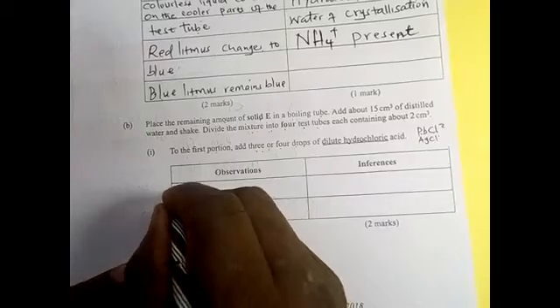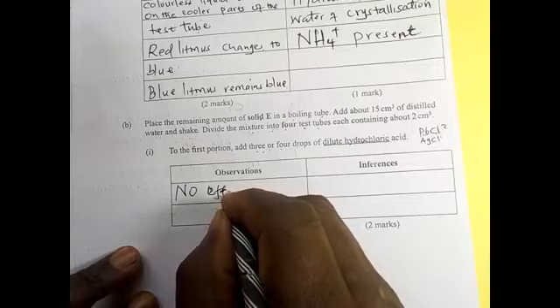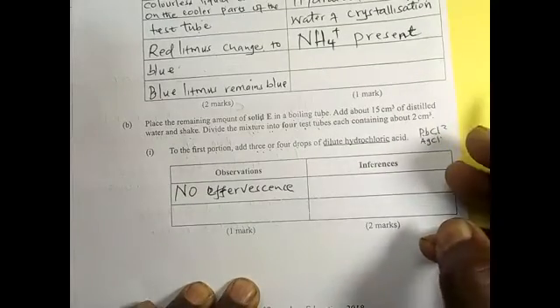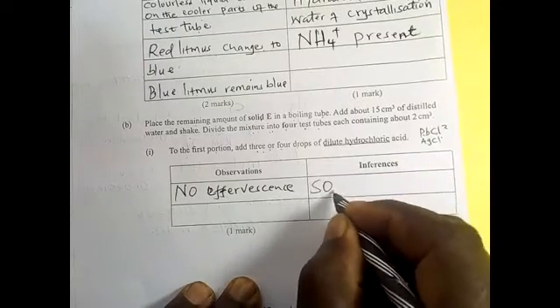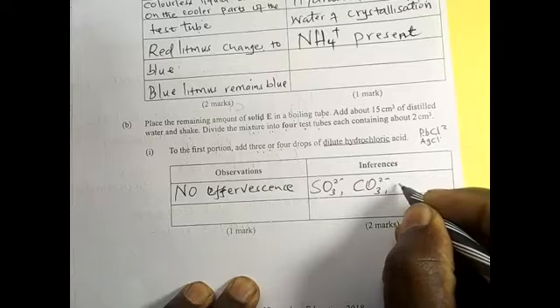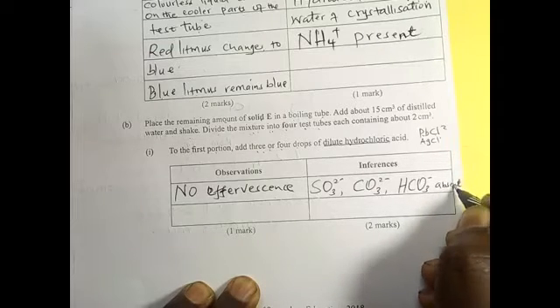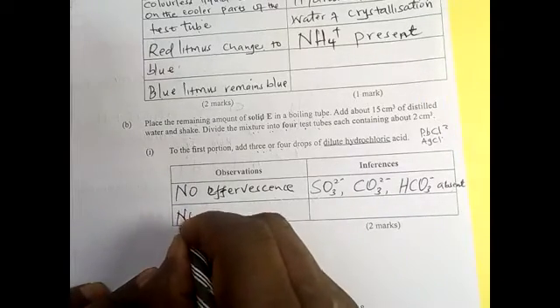So the observation is that number 1, there is no effervescence. If there is no effervescence, then it means inside there was no carbonate, there was no sulfite, there was no hydrogen carbonate. Absent. This was absent.